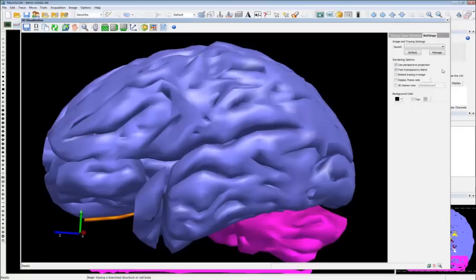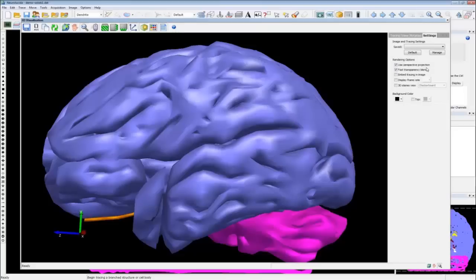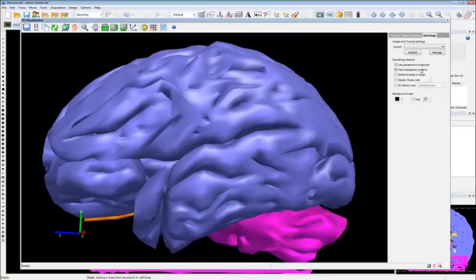Under Rotation, select auto rotate and adjust the speed and angle. When making movies, keep the speed low and the angle relatively straightforward — too many crazy angle changes and people will get nauseous. Under the Settings tab, save all your settings including transparency, angle, and glossiness so you can quickly reproduce the same view for your control animal or next reconstruction. Under rendering options, perspective projection and fast transparency blend are enabled by default. Fast transparency blend renders translucent objects from front to back for more accurate transparency when objects overlap.